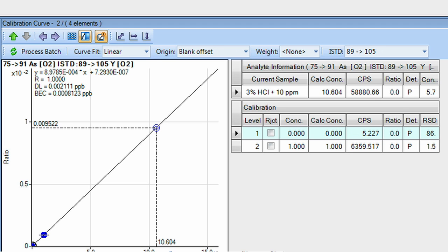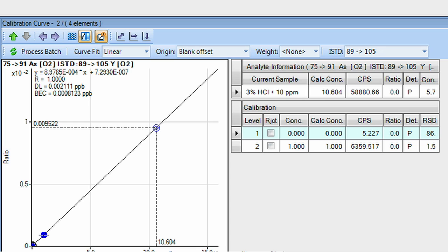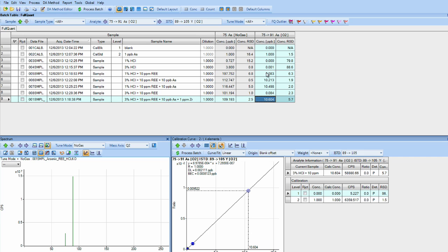In the 75 mass shift to 91 mode, we have a detection limit of two parts per trillion and 800 PPQ BEC. So now let's go and look at our data.